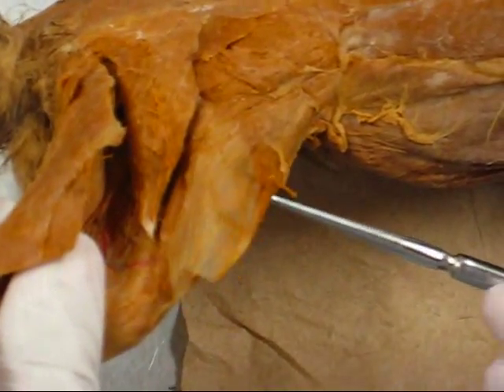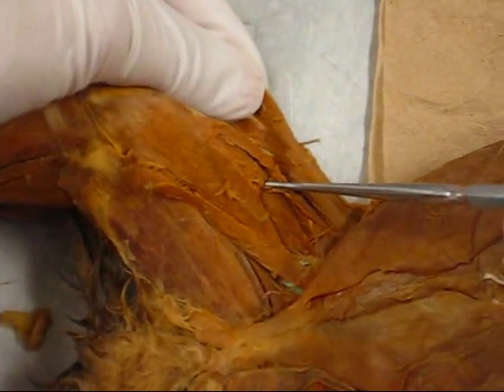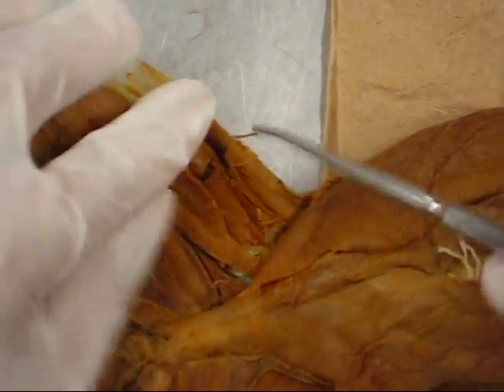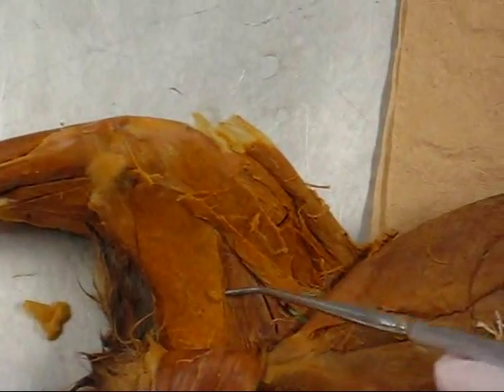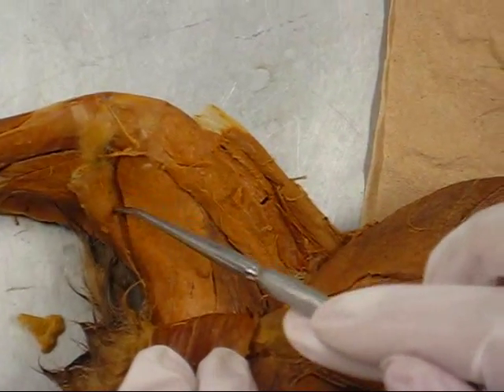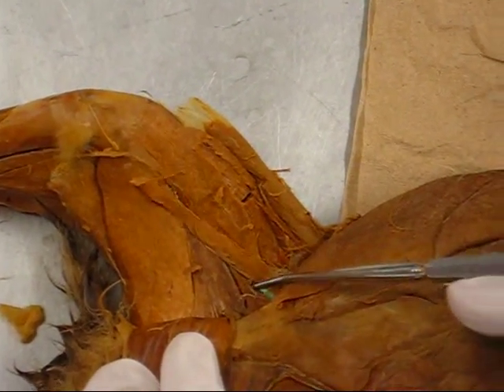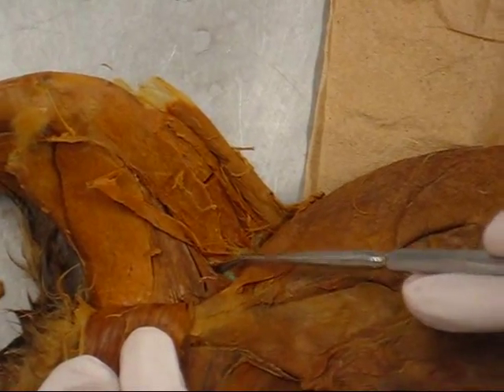Tensor fasciae latae. That was the vastus lateralis. Rectus femoris, and deep to that is the vastus intermedius, vastus medialis. Sartorius, gracilis, semitendinosus, semimembranosus. Adductor femoris, adductor longus, and then in here is the pectineus.